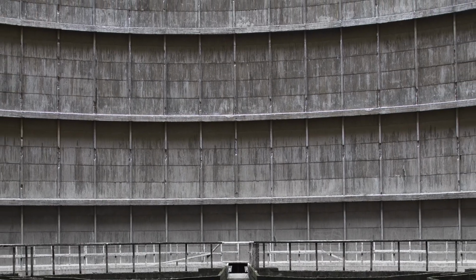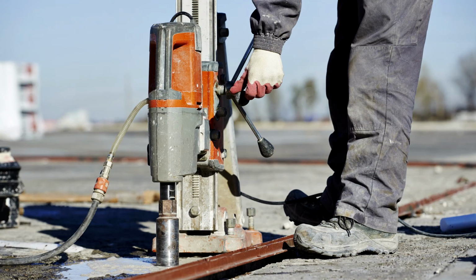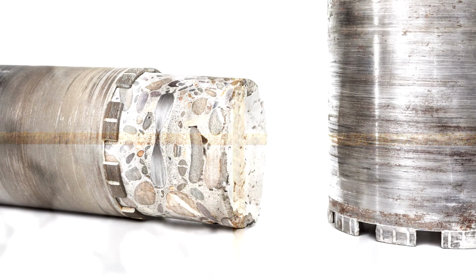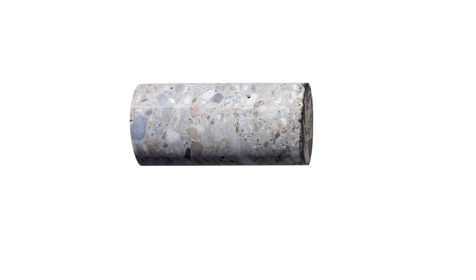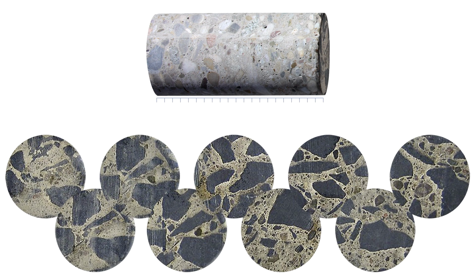One method to achieve this reduction was through an understanding of radioactivity depth profiles determined through systematic sample core drilling of key structural materials such as concrete and steel. For example, in the laboratory, concrete cores are subsampled by slicing, then analyzed for their radionuclide components to generate accurate contamination depth profiles for each depth increment.